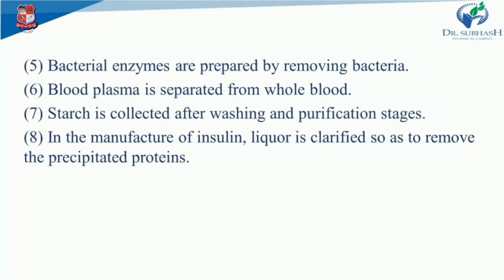Now, before we move further, do you know what clarified means? Right, clarified, we have studied in filtration that clarification is a type of filtration, right? Which means in manufacture of insulin, liquor is filtered or separated. You can easily call it a type of separation so as to remove some of the precipitated protein that are not required, or some are most required.